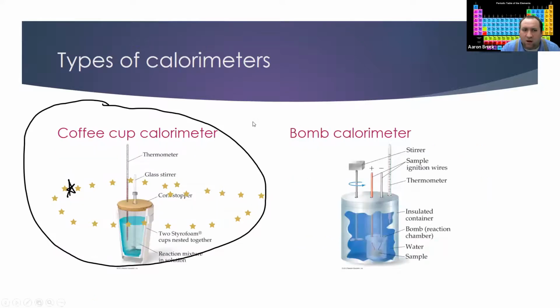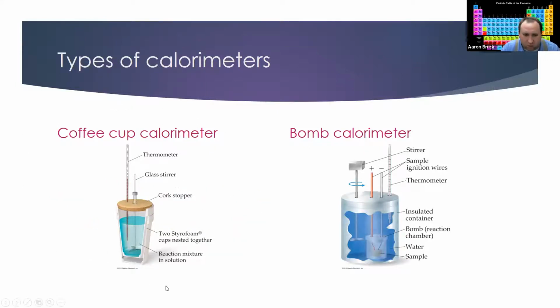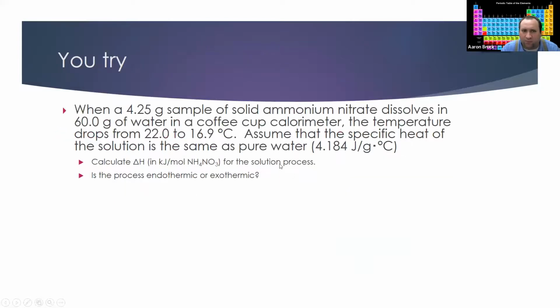So this is what each one of them looks like. You're going to work with an apparatus very, very similar to this in this lab. Again, this is kind of cool. We use electrical leads to ignite the substance, but everything is kind of self-contained in a bomb calorimeter.